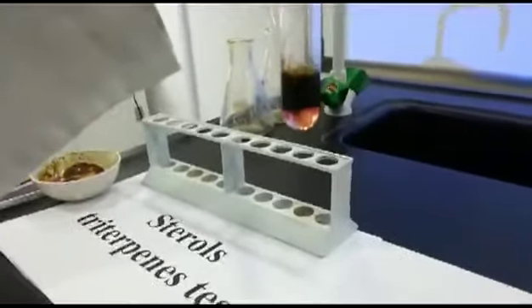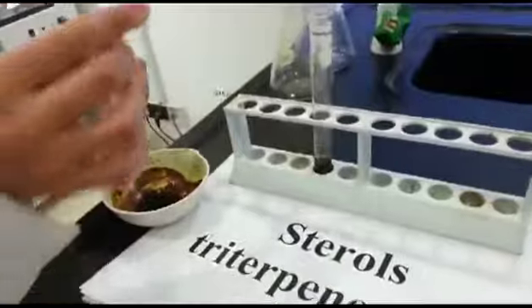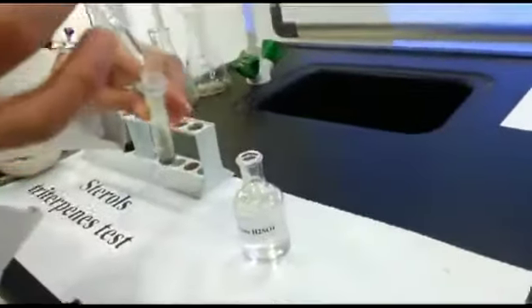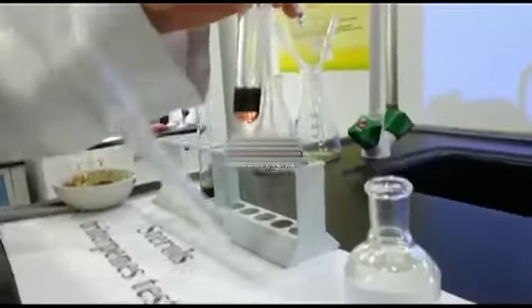You can see here in this test tube. Then sterols and triterpenes: we will take 2 ml of alcoholic extract plus a few drops of H2SO4. A reddish brown ring will show a positive test, as you can see in this test tube.